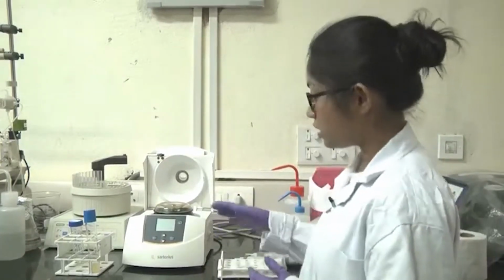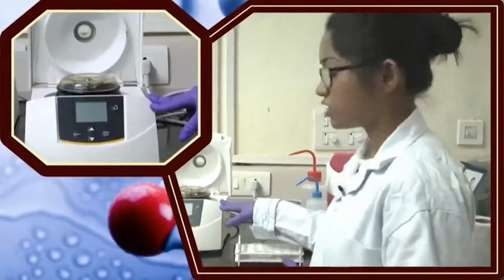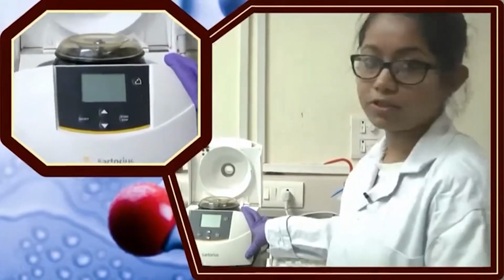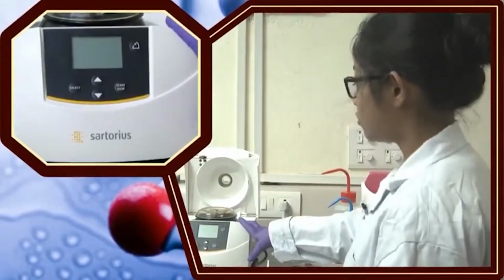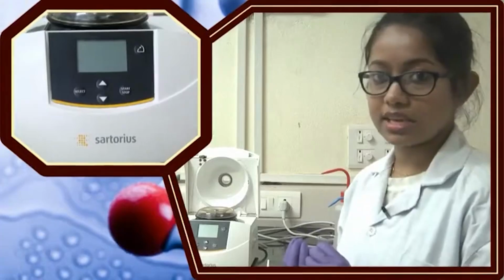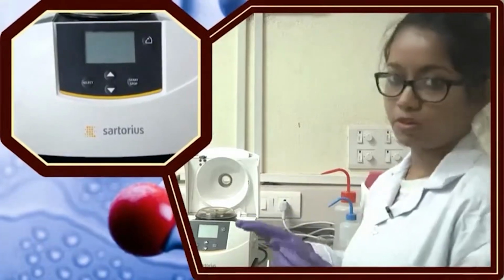Another thing I would like to mention here is the other important instrument which we need during plasmid extraction, the centrifuge. This is a simple centrifuge machine where we will isolate the cells from the culture media. When we start the centrifuge, it will rotate and put a centrifugal force on the different components present inside the culture, and depending on their size and shape, they will precipitate because of the centrifugal force.